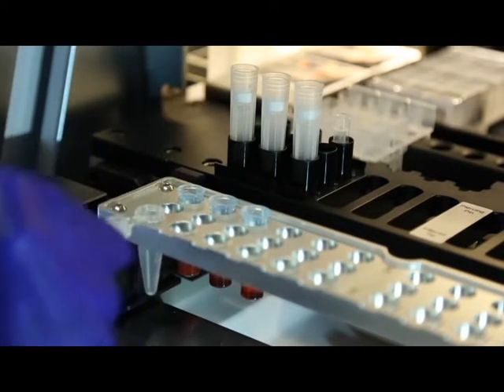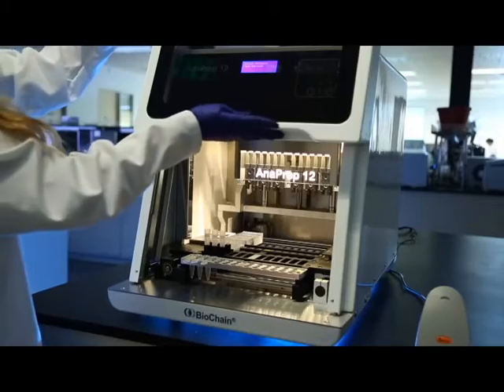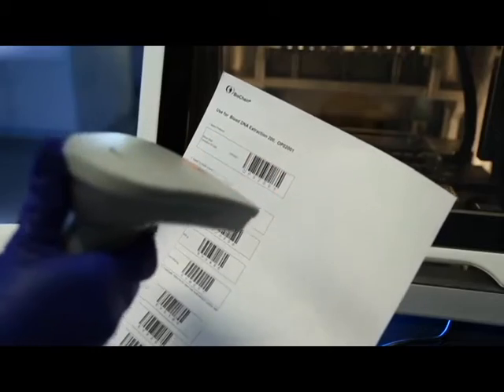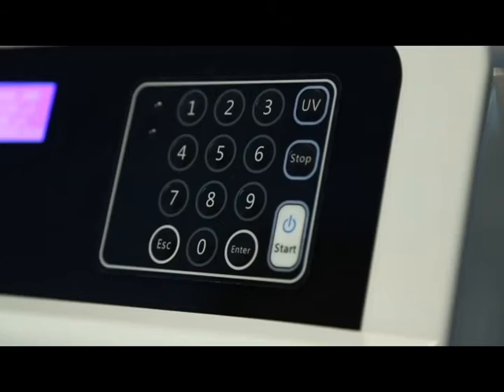In this single unit, you can run between 1 to 12 samples per run. Once the machine is loaded, use the barcode scanner to select the specific protocol, sample volume, and elution volume. Anaprep handles the rest.